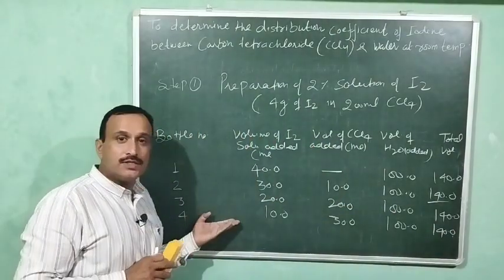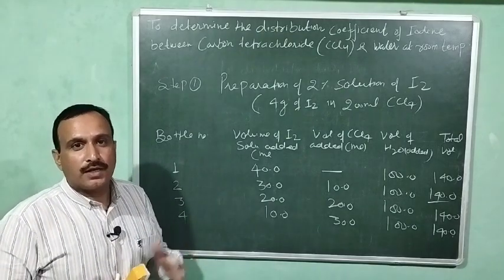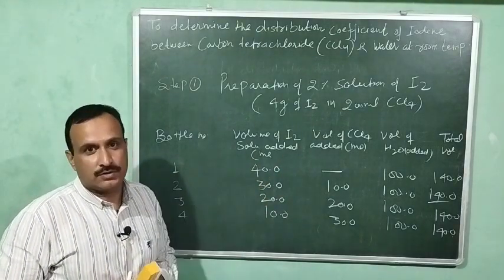So in this way we will prepare the solutions in different reagent bottles.